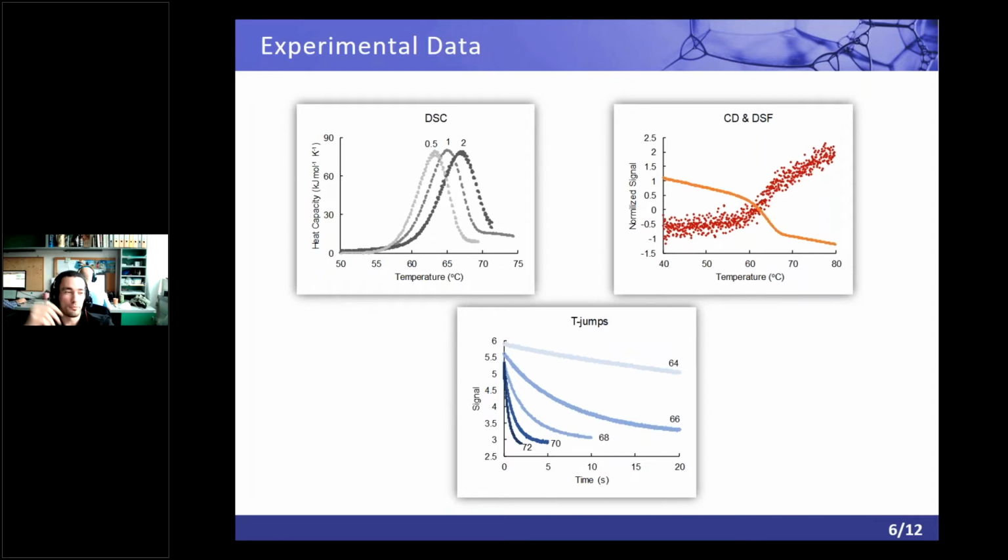There were some tools for individual analysis, but they included very simple models of just one transition, for instance, and for our proteins they didn't work. So what started as a script in MATLAB eventually became a server which is now called CalFitter, and now we're working on the second version of this server.